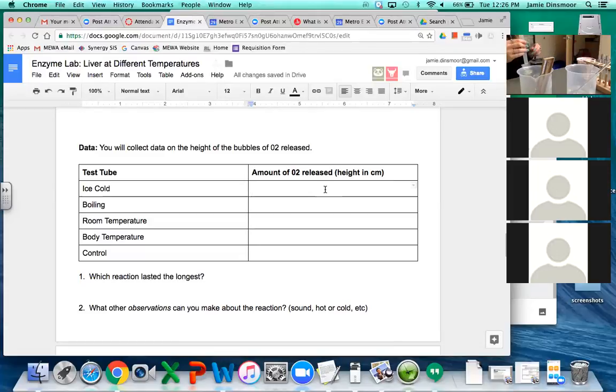Okay, I guess we'll wait for them to come back before we do the control. Let's see. Did he turn the flames on over there? I think you did.